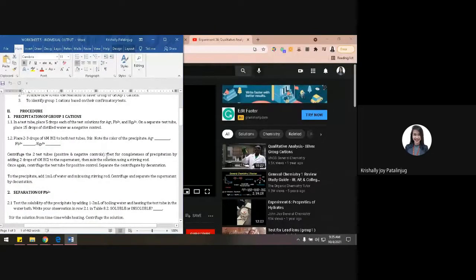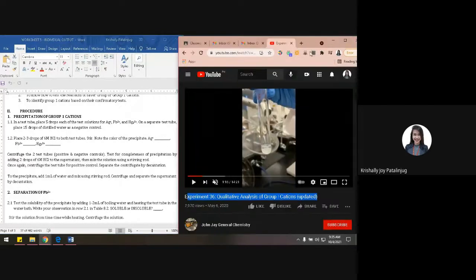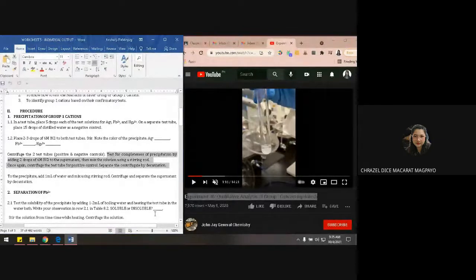So where are we now? We are here. Kindly read, Crazel. Is Crazel here? Yes, ma'am. Test for completeness of precipitation by adding 2 drops of 6 molar hydrochloric acid to the supernatant, then mix the solution using a stirring rod. Once again, centrifuge the test tube for positive control. Separate the centrifugate by decantation.